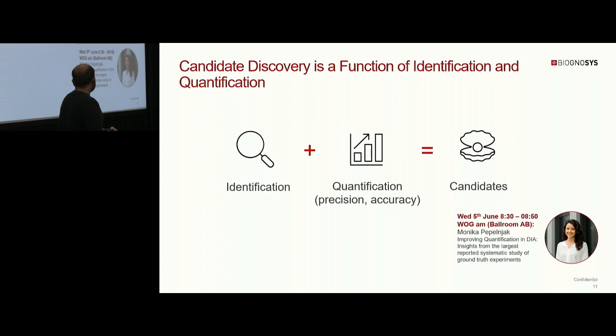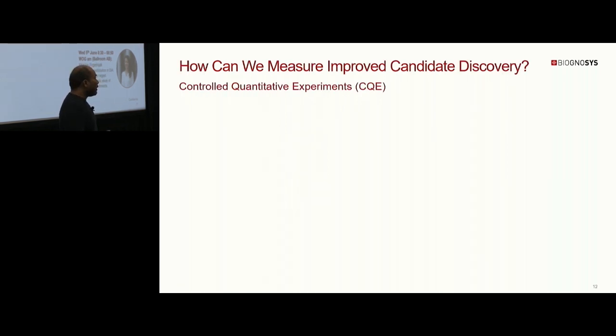This is a very interesting topic, and Monica has a talk about it tomorrow, so I can highly recommend you to attend, where she goes a lot more in detail than I will right now. Our approach to measuring this is maybe not too different from many of you: we rely on the so-called controlled quantitative experiments.